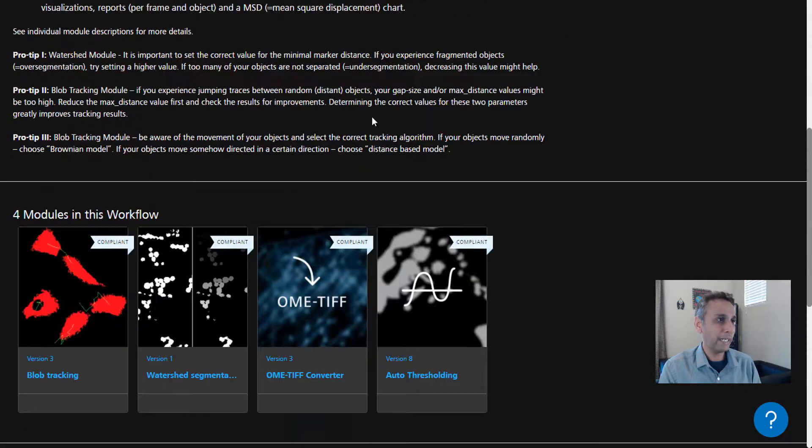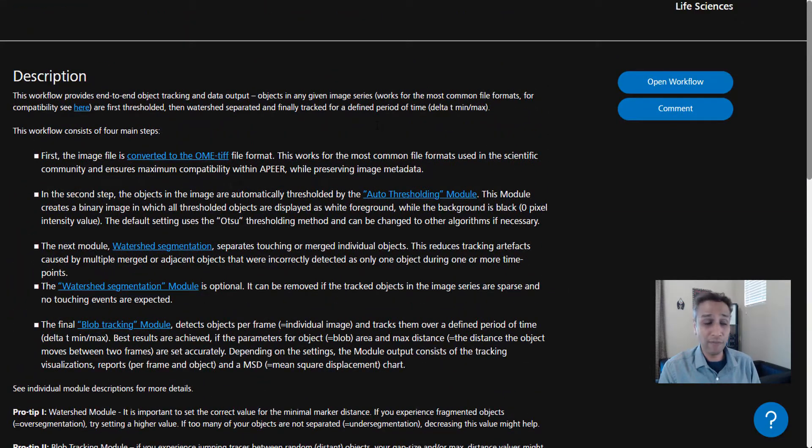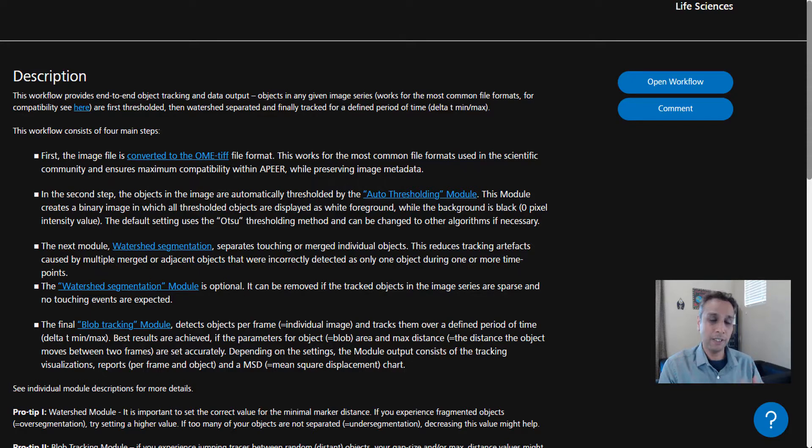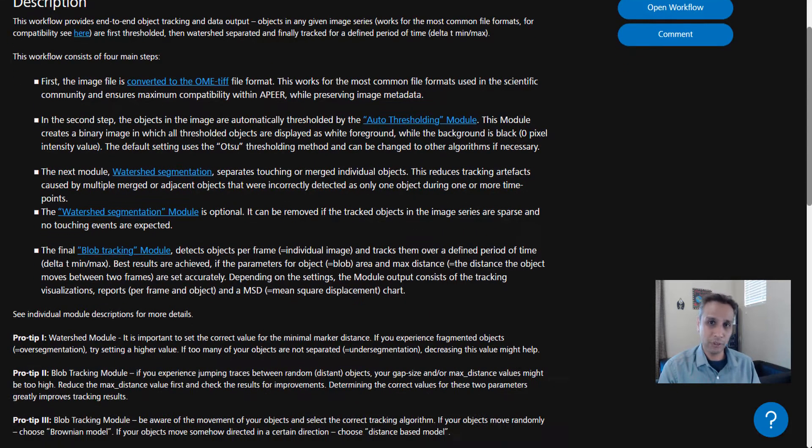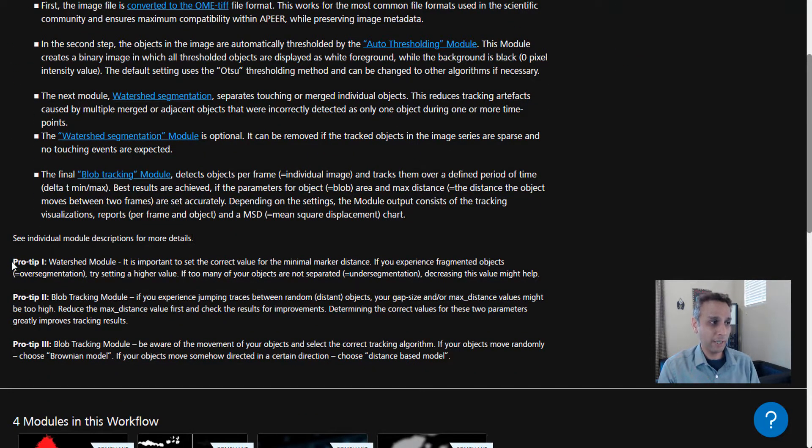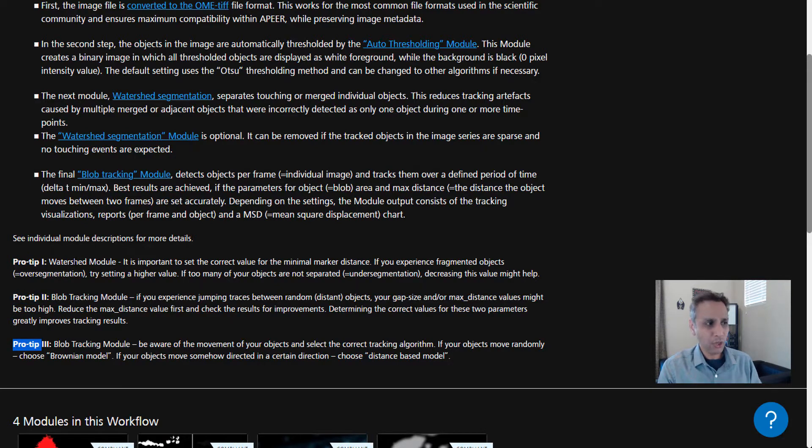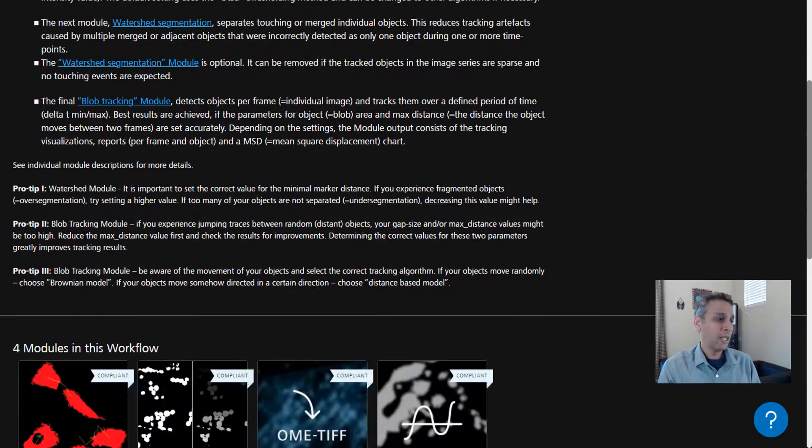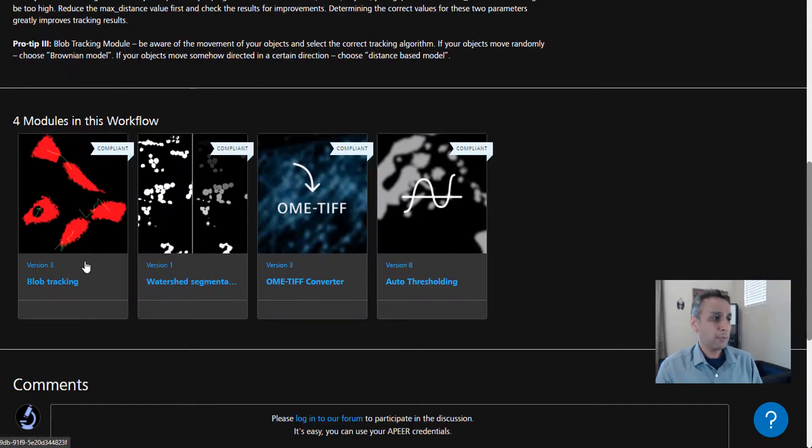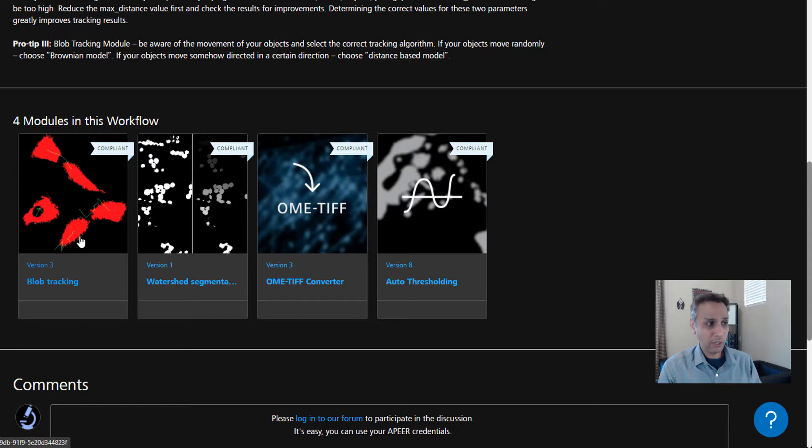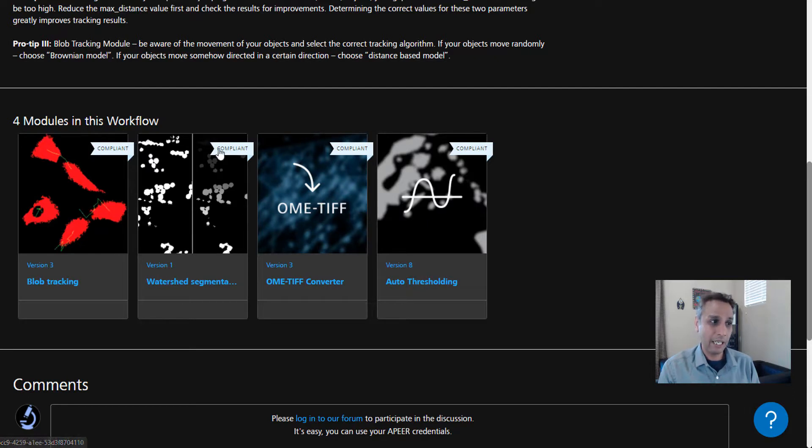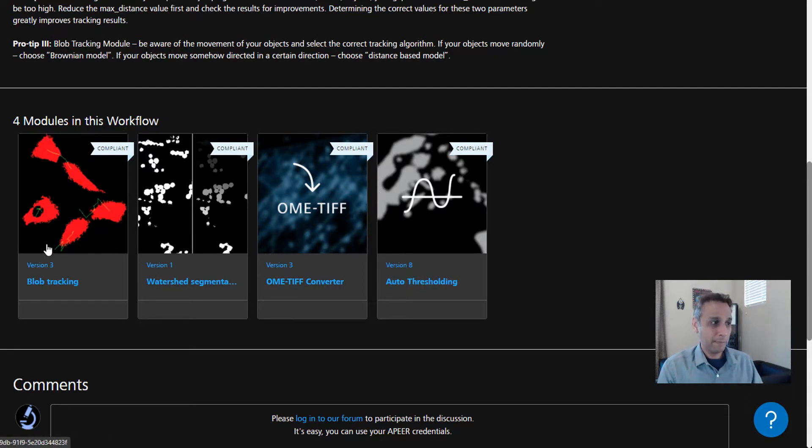We can search for tracking right here, but this is the first workflow in the list. If you're watching this later and this workflow doesn't show up, go ahead and search for tracking. Click on this workflow. A workflow is a concatenation or arrangement of modules such that you achieve a specific task. Let's scroll all the way down. I definitely recommend you read the entire description, which gives you a good idea of what the workflow is, what modules it consists of, and any tips or tricks.